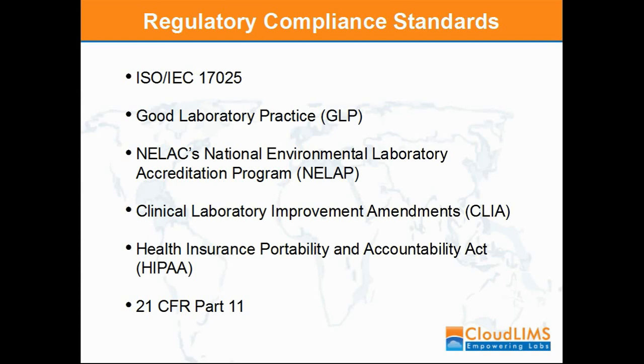FDA's 21 CFR Part 11 defines the criteria under which electronic records and electronic signatures are considered trustworthy, reliable, and equivalent to paper records and handwritten signatures executed on paper.